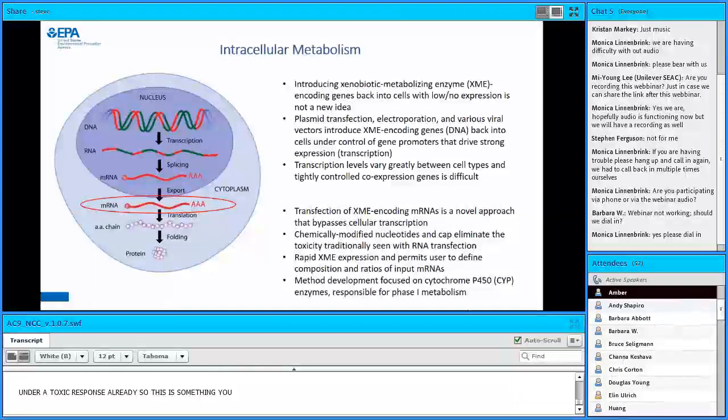assay. But there's been a number of advances in RNA synthesis over the past few years involving how the 5' caps are engineered, and then the use of what are called pseudobases, so substituting the typical uracil, thymidine, cytosine, and guanine that are used in RNA. There are pseudobases that you can substitute, and the nice thing is functionally it acts just like an RNA. As a matter of fact, you can actually enhance expression off these chemically synthesized RNAs.